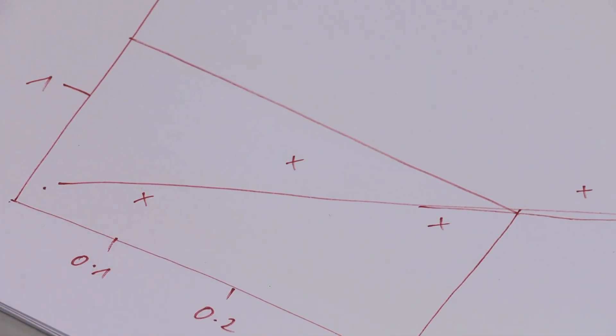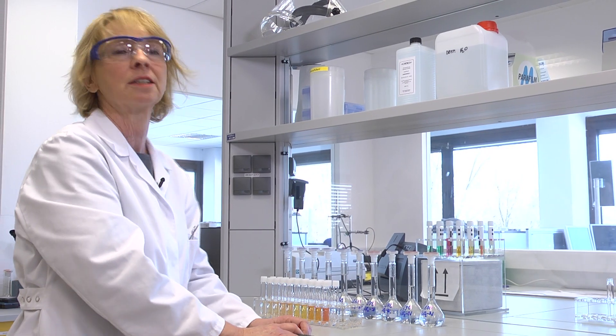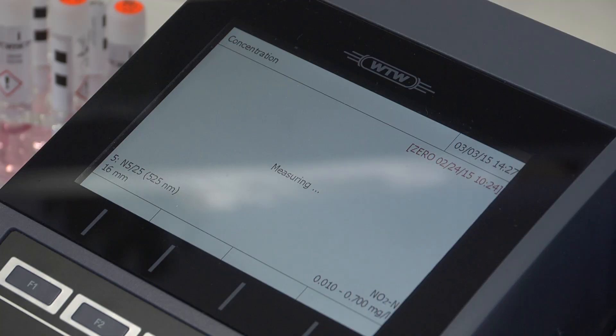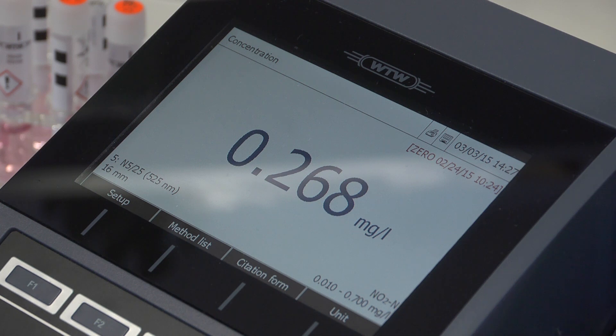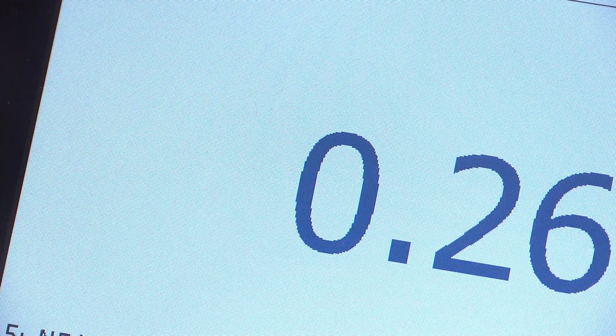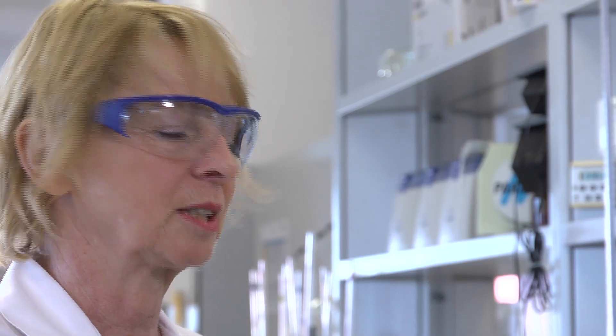Nowadays, a photometer is pre-programmed with calibration data and concentrations are calculated automatically. Using a modern cell test, I would like to show how method data is stored in the programs of the device. Once the reading is completed, the screen shows the result, the wavelength being used, and the appropriate test. Here we can see the measuring range and citation. The units can be switched between milligram per liter, parts per million, or millimole. All of this data is programmed and stored in the photometer.